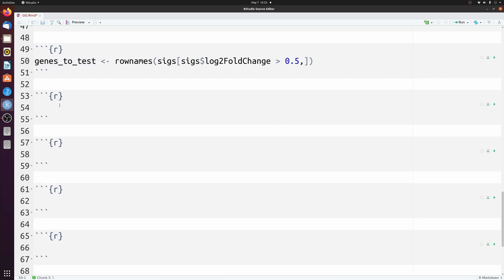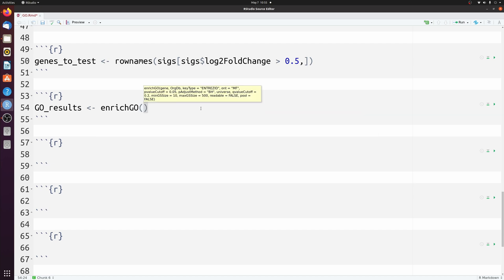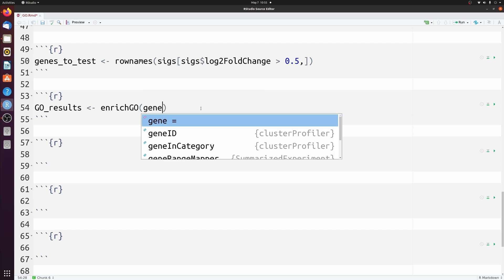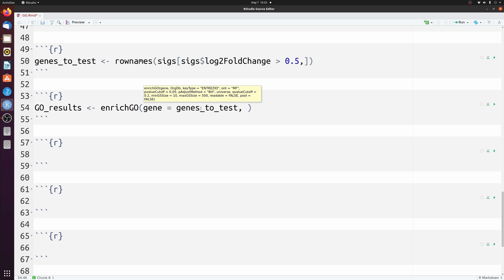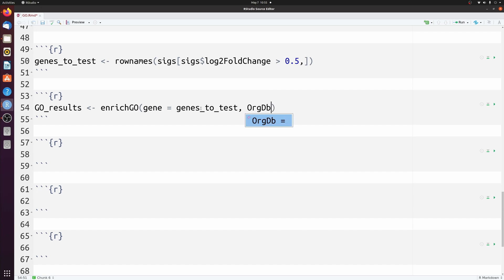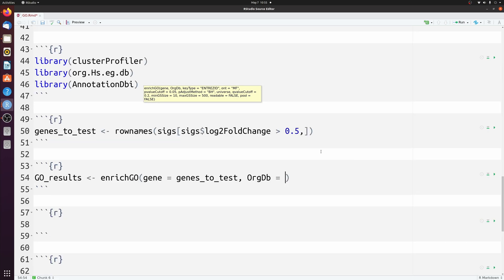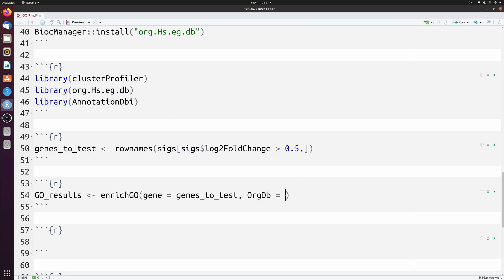Now we can run the actual GO command. We're going to save the output to go_results. The command from clusterProfiler is enrichGO, and we're going to point it to genes_to_test, which we just saved. We need to point to the database we installed, so org.db is set to that database. Then we need to specify the key type — since I have Ensembl IDs, I specify Ensembl IDs here.